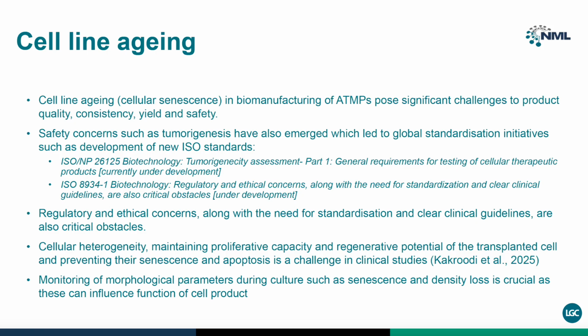Regulatory and ethical concerns, along with the need for standardization and clear guidelines, are also critical obstacles, and cellular heterogeneity, maintaining proliferative capacity and regenerative potential, preventing senescence and apoptosis is a challenge in clinical studies. So monitoring of morphological parameters during cell culture, for example, such as senescence and density loss, can be quite crucial in influencing the function of the cell product.